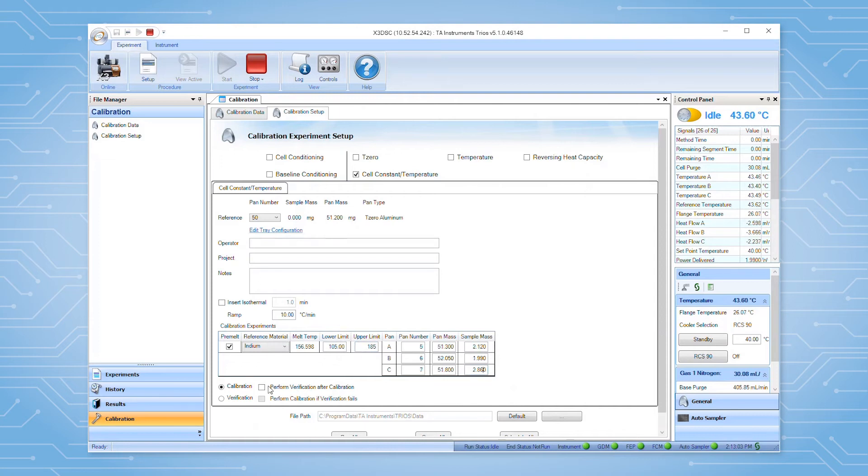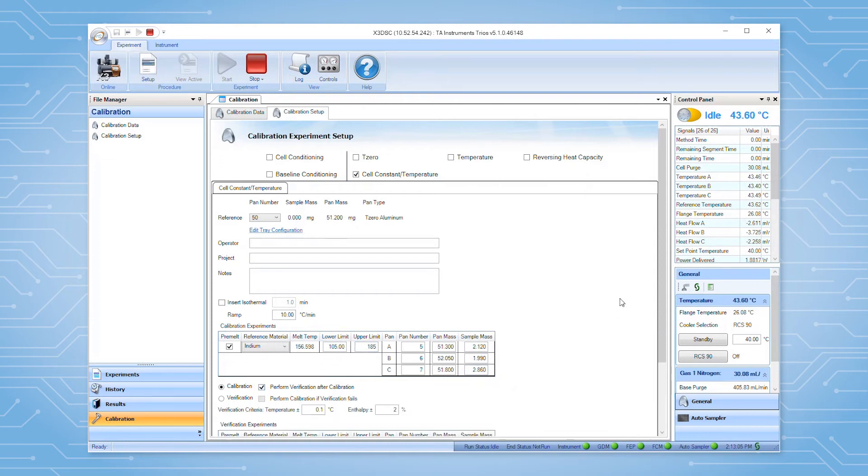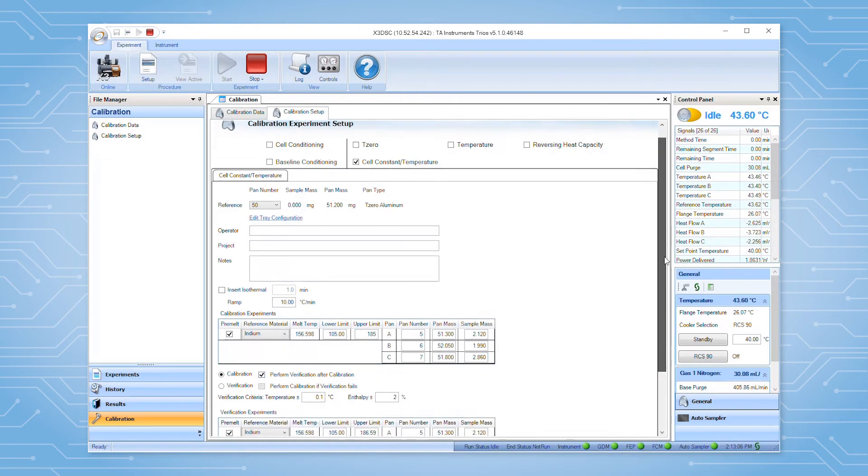If you would like to perform a verification after the calibration is applied, select the appropriate option and fill out the criteria and sample information to be used.